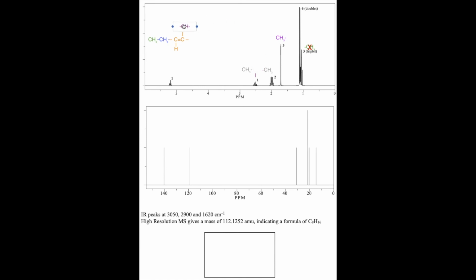So I'll put my isopropyl group up here, like this. And what else do I have? My methyl group. Oops. This guy right here, which I need to flip around so that I can attach it correctly, like that. There. And that's it. I'm out of peaks, I'm out of pieces.